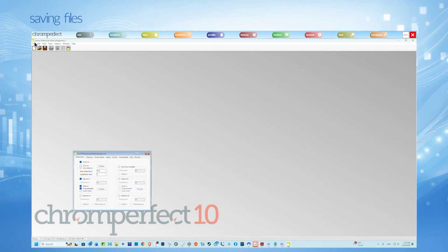To save changes under a different file name, choose File, Save As. A file inquiry dialog appears. Enter the new file name and press OK. If the file already exists, you will be warned and given the option to cancel. If the save succeeds, the form caption updates to the new file name and the version number resets to 1. The form remains open, and future save actions apply to the new file.